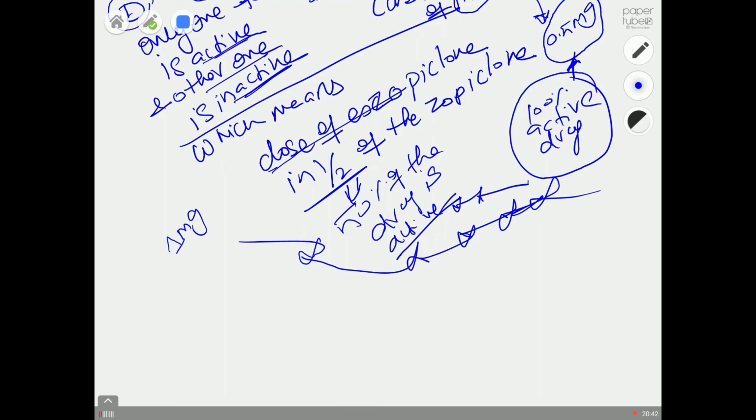We are not going to deal with a racemic mixture, or a polymorphic transformation during the crystal growth process. We are going to take a form 1 paracetamol, and then grow that crystal from the supersaturated solution.